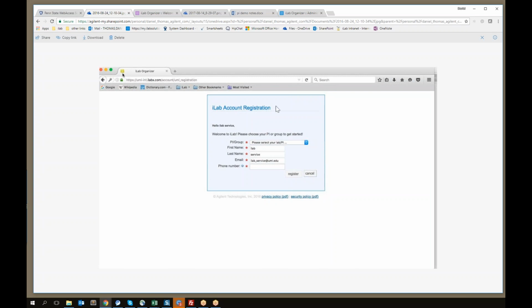And this screen will ask you to select your PI or your lab. And at that point, you'll select the administration lab, and then there will be an institutional process in which Misty will create a lab for you and assign you as the PI of that lab. You'll then have the opportunity to, through the system, request those unrestricted funds that you have access to.